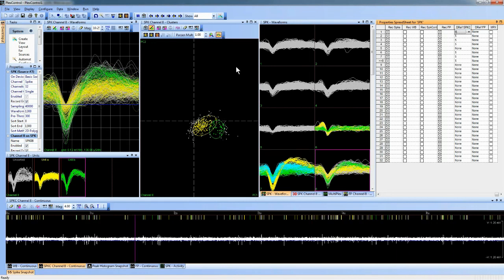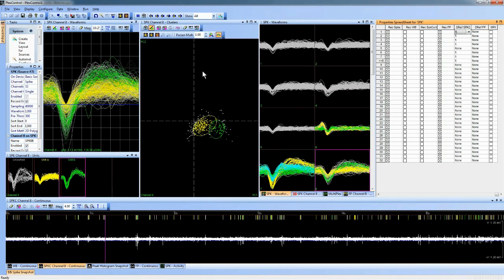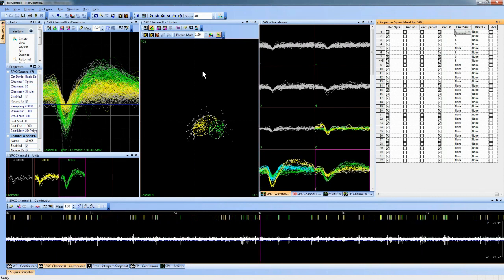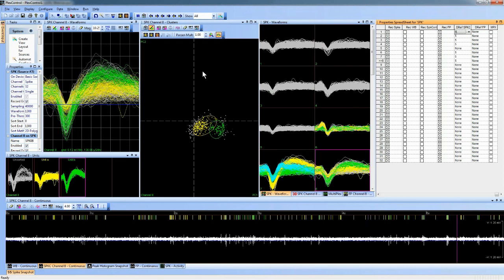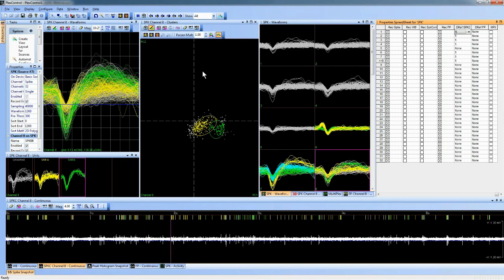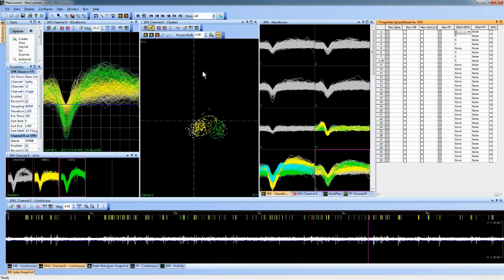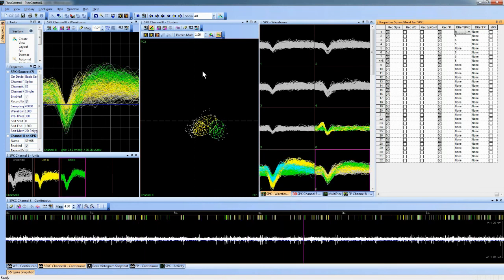That's great. Okay, a question from Dekra. He says that I have a problem with some of my spikes not being aligned with the rest of the spikes. As a result, these spikes do not cluster well with the other waveforms, making it seem as though they come from a different neuron. So it says, I have tried aligning the waveforms based on peak after acquisition, and I've also tried different threshold levels during acquisition. But the latter often leads to a large data set that I feel can be more accurately sorted. So how should I approach sorting this type of data set?